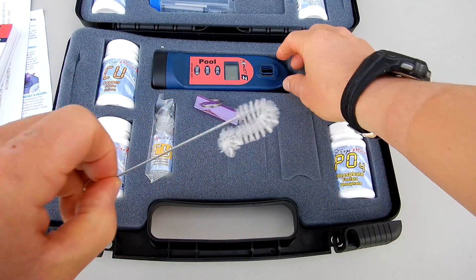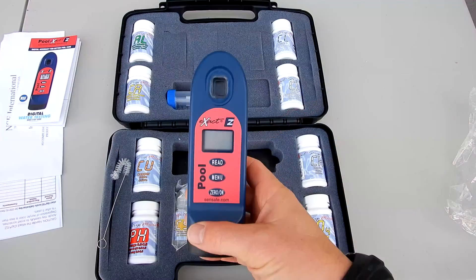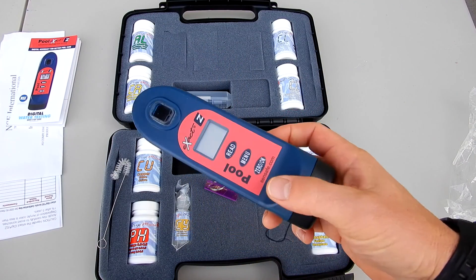Included here on the side is this brush, which you would use to clean the chamber in between testing. And the POOL EXACT EZ will do 10 test factors for you.